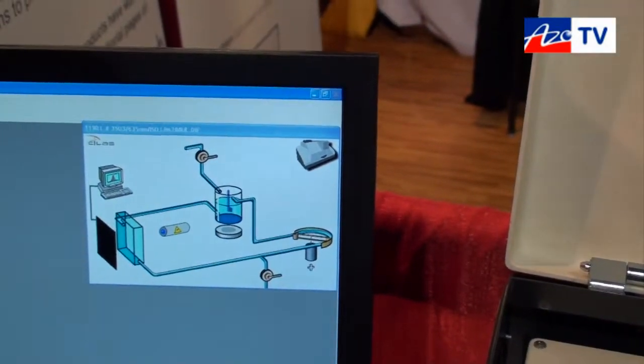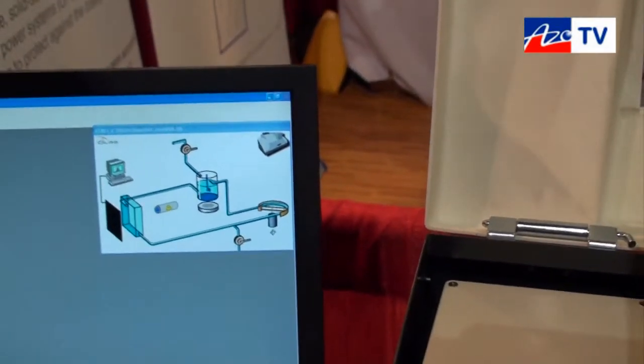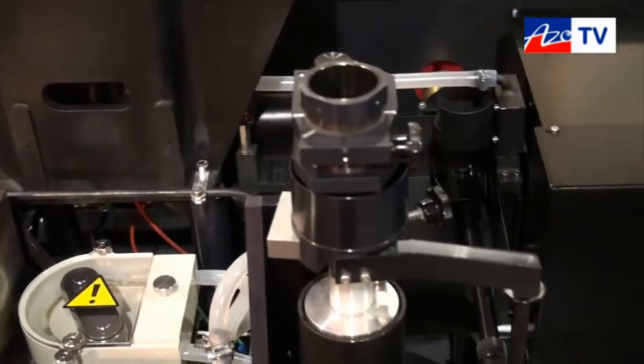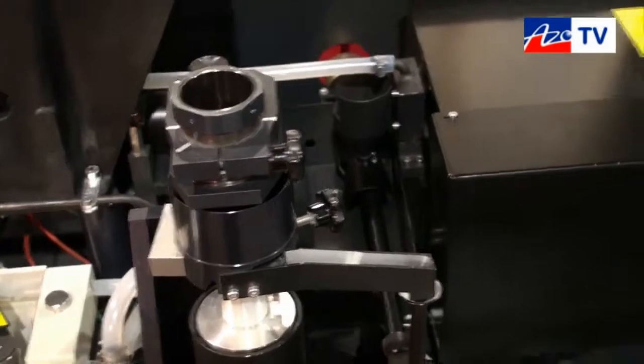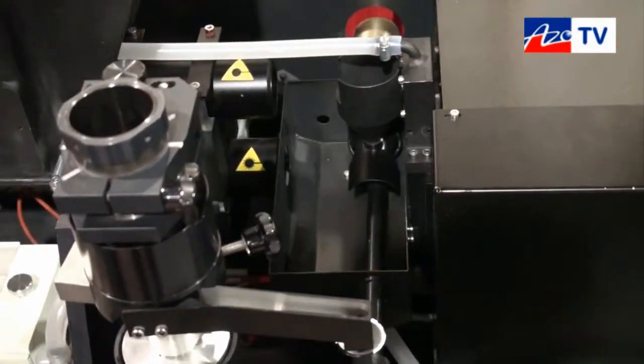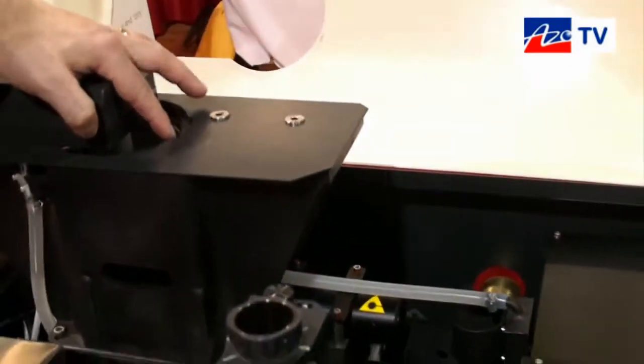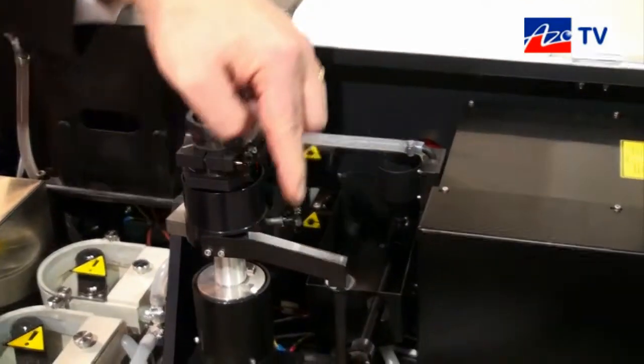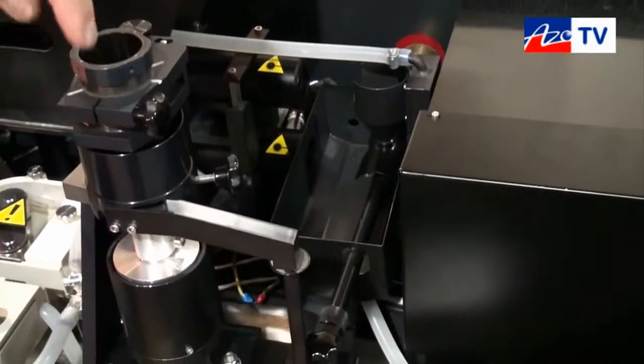And we will show you that in a second. I will hit the liquid mode and I'll go to dry now and you can see all that we've done is we've changed it from putting a sample in the tank up above to putting the sample in the vibratory feeder.